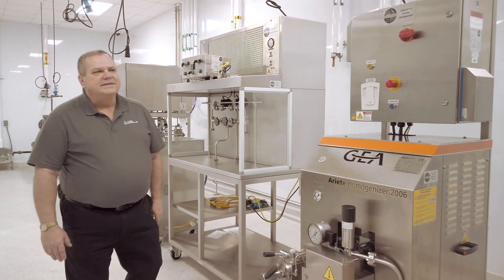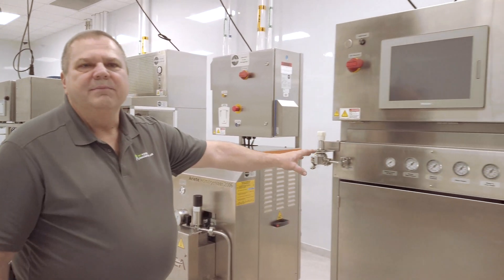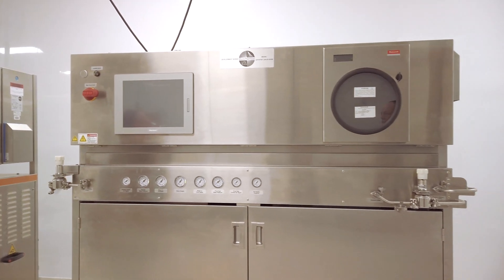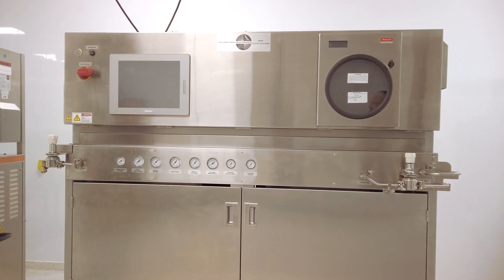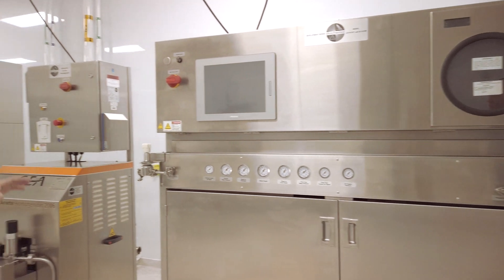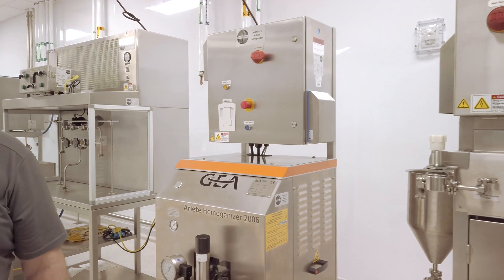One of the process steps for beverages is done in a Microthermics indirect steam processor. This particular piece of equipment is utilized by the beverage industry every day to pasteurize and sterilize the beverages we consume. If we have high-fat products we want to also pass through here, we have a homogenizer that allows us to reduce the particle size of a fat globule.